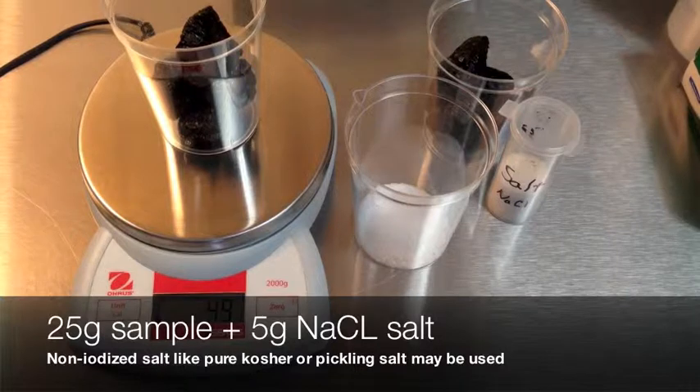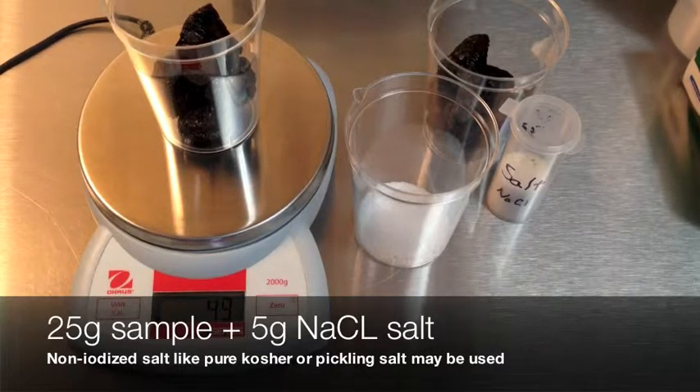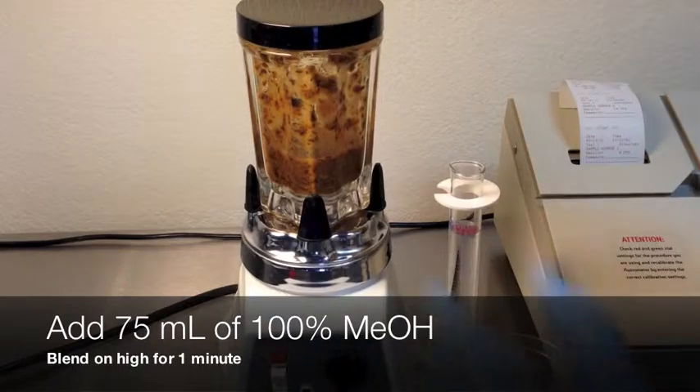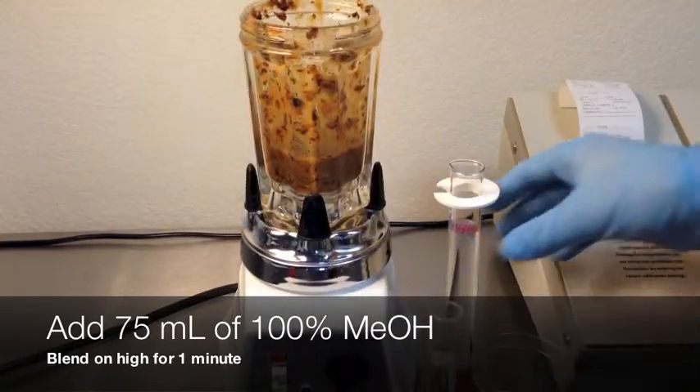Weigh 25 grams of sample and combine with 5 grams of pure salt. A non-iodized salt like pickling or kosher salt is acceptable. Combine in the blender with 25 milliliters of pure water. Blend on high for one minute and allow the water to soak into the sample. Add 75 milliliters of pure methanol and blend on high for one minute to mix.